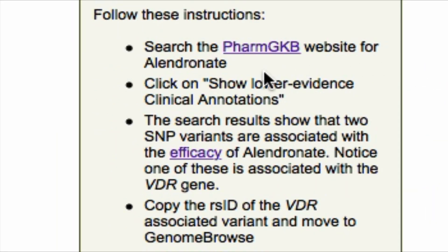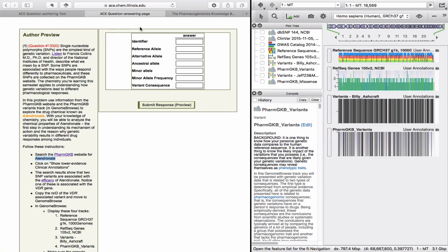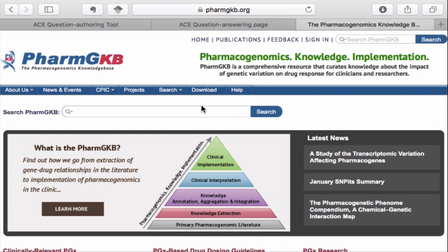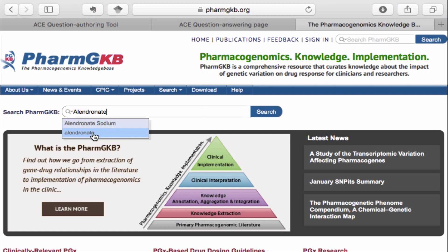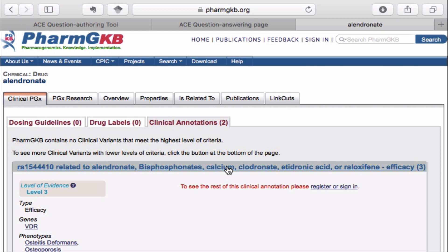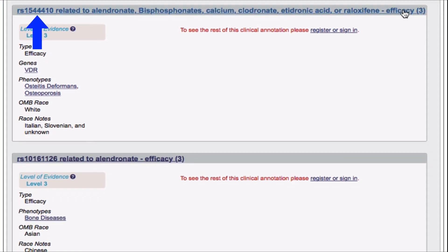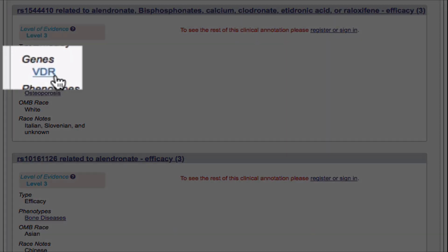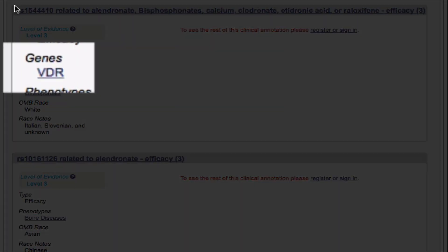Search the PharmGKB website for Alendronate. Two clinical annotations are found for this drug. Click on 'Show lower evidence clinical annotations.' The search results show that two SNP variants are associated with the efficacy of Alendronate.